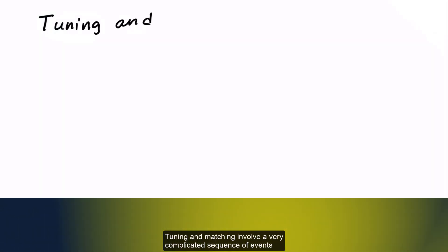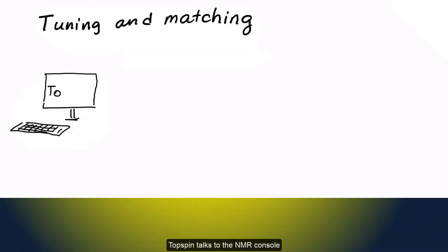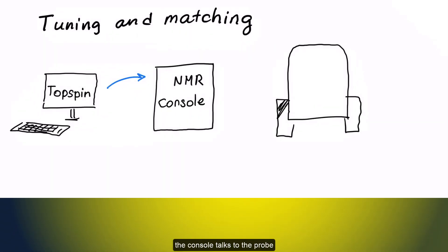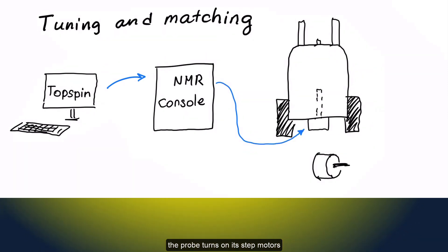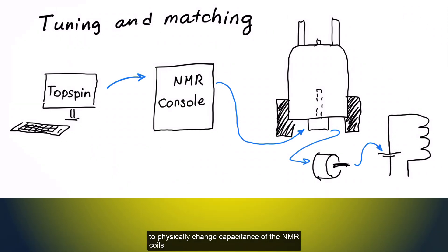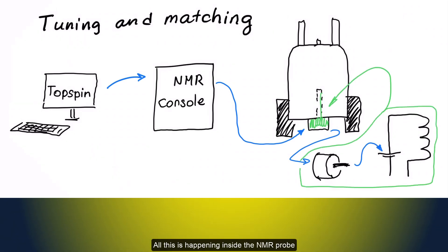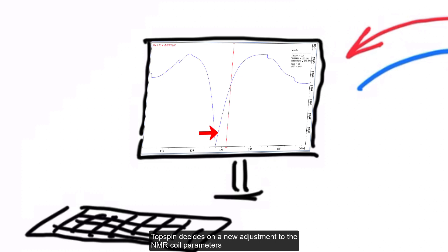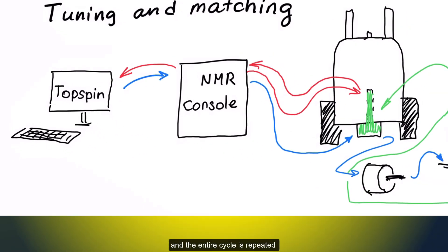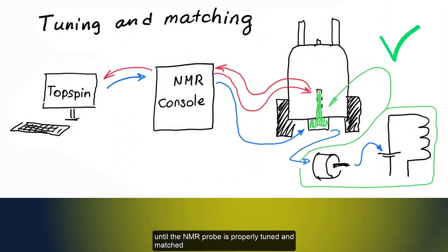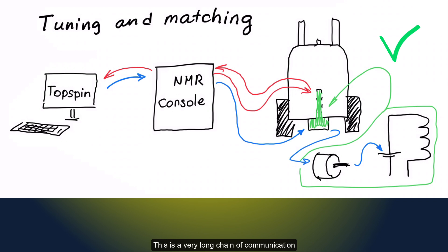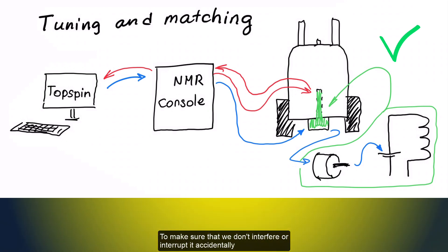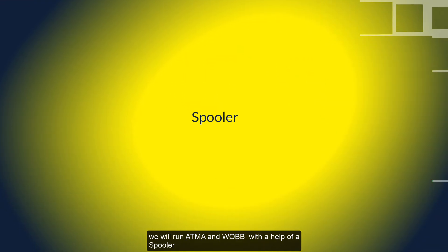Tuning and matching involve a very complicated sequence of events. Topspin talks to the NMR console. The console talks to the probe. The probe turns on its step motors to physically change capacitance of the NMR coils. All this is happening inside the NMR probe. Once the coils are adjusted, the console measures a new resonance curve, we call it a wobble curve, and sends it back to topspin. Topspin decides on a new adjustment to the NMR coil parameters, and the entire cycle is repeated, until the NMR probe is properly tuned and matched. This is a very long chain of communication. To make sure that we don't interfere or interrupt it accidentally, we will run ATMA and wobble with the help of a spooler.